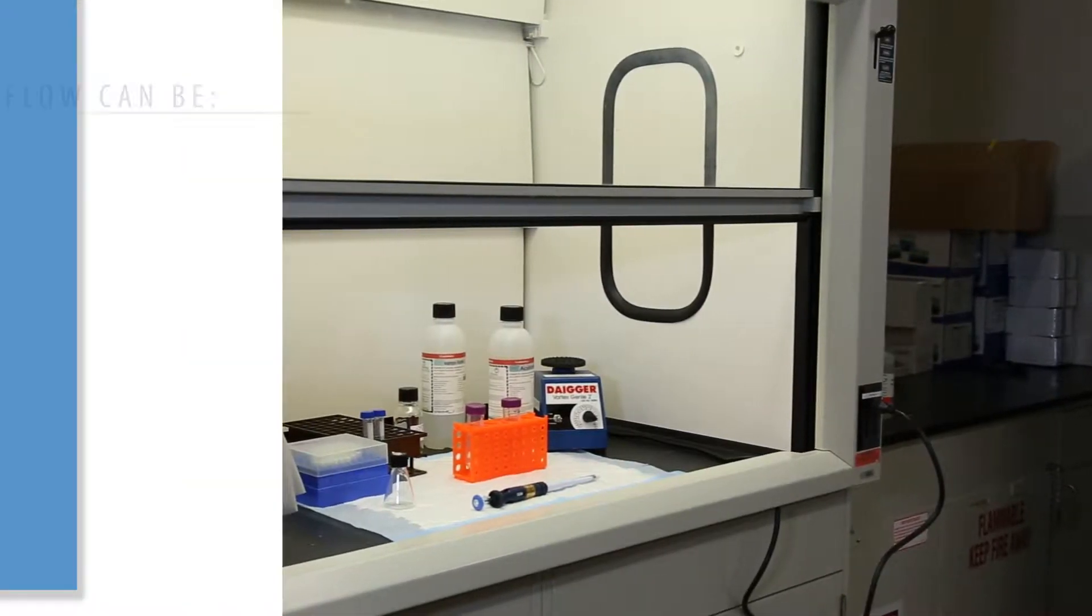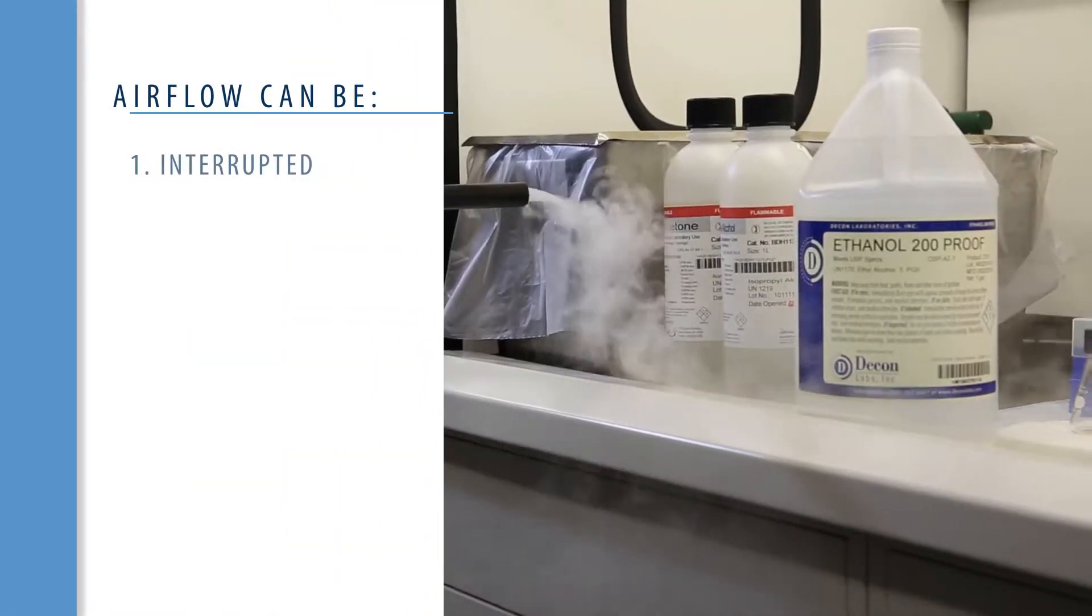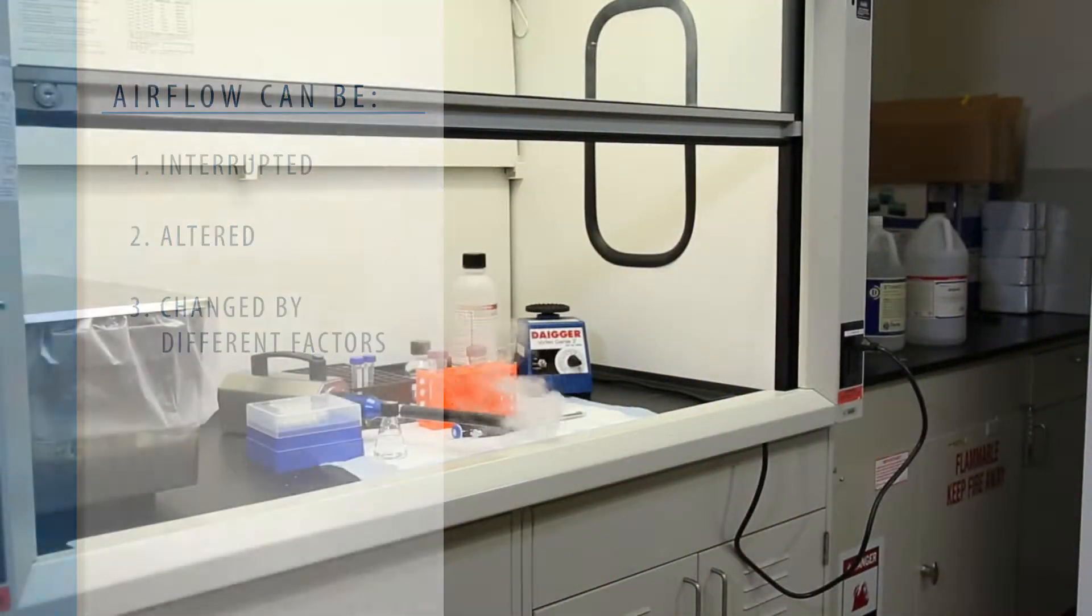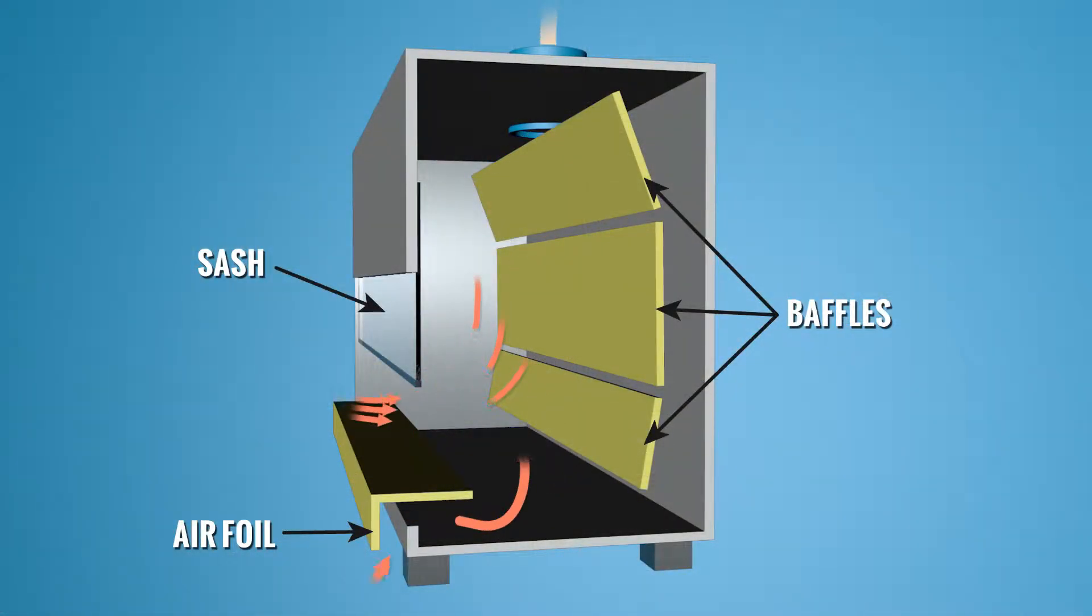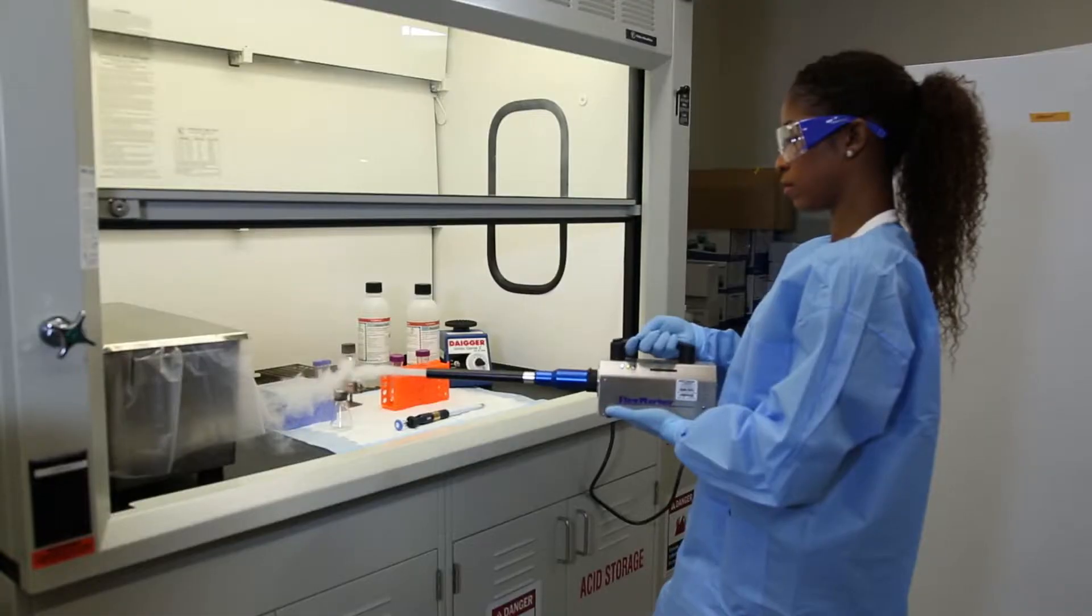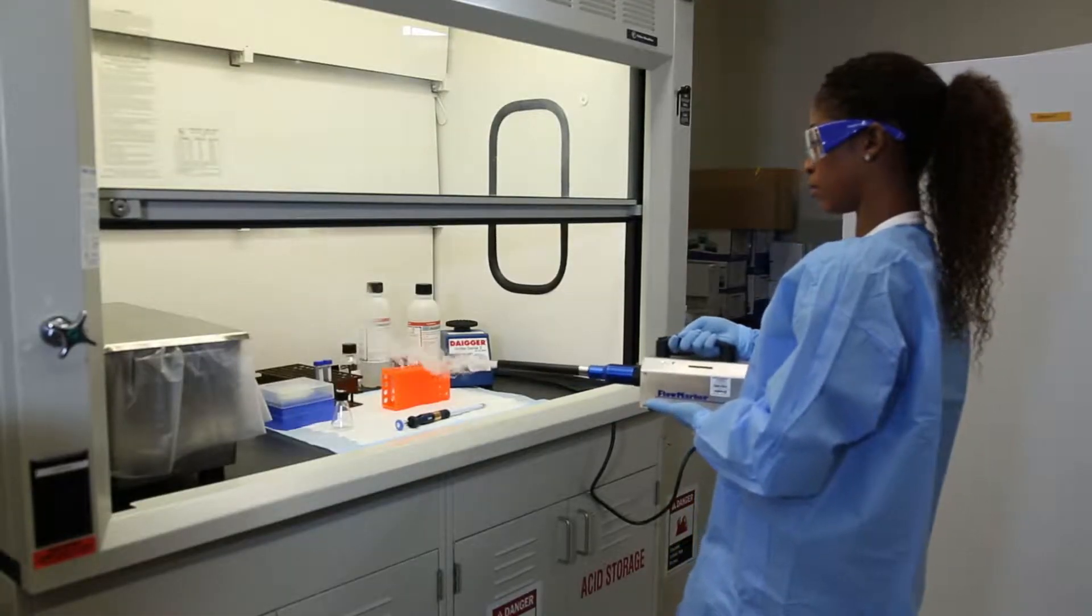Air flow in a chemical fume hood can be interrupted, altered, and changed by different factors. Air flows into the hood capturing and containing contaminants, preventing them from escaping into the laboratory room. The smoke shown here provides visual demonstration of how air flows in a fume hood.